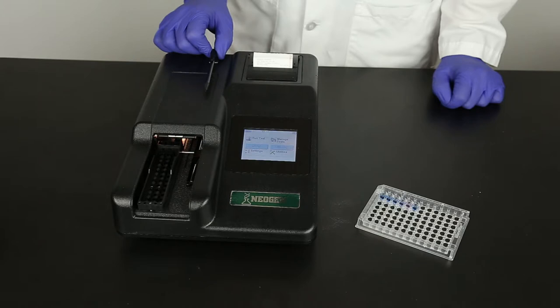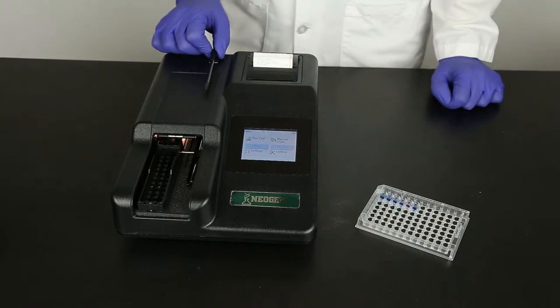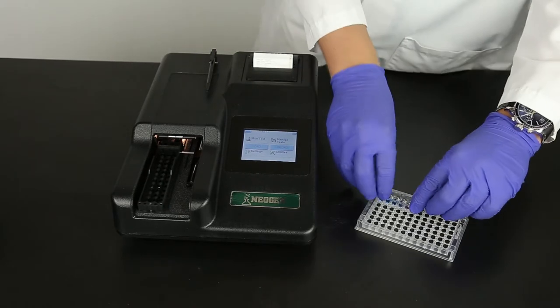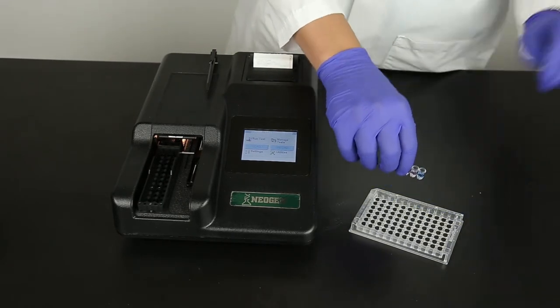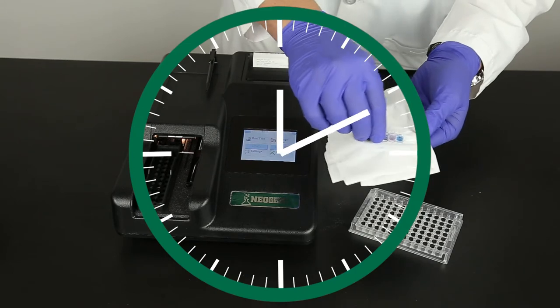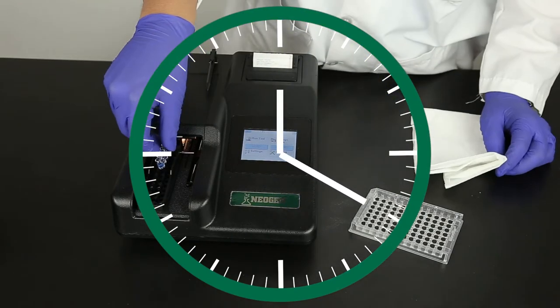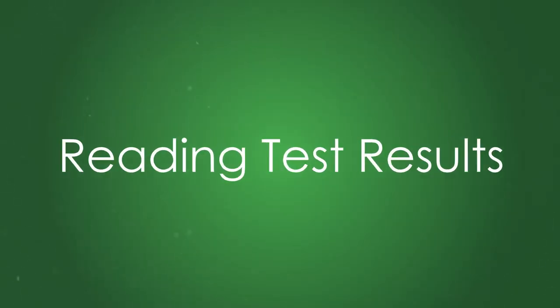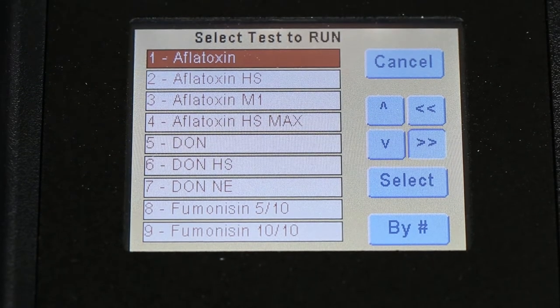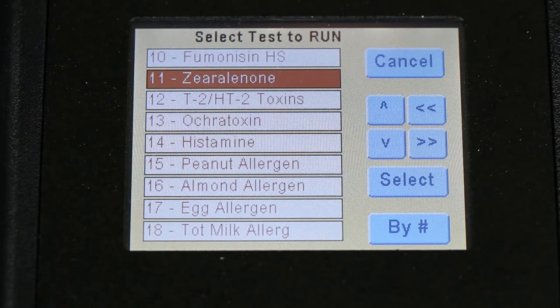You have up to 20 minutes to read the wells using the StatFax 4700 microwell reader or an equivalent microwell reader with a 650 nanometer filter. Strips read after 20 minutes will not give accurate results. Turn on the StatFax, scroll to select the test Zearalenone, and confirm the selection.